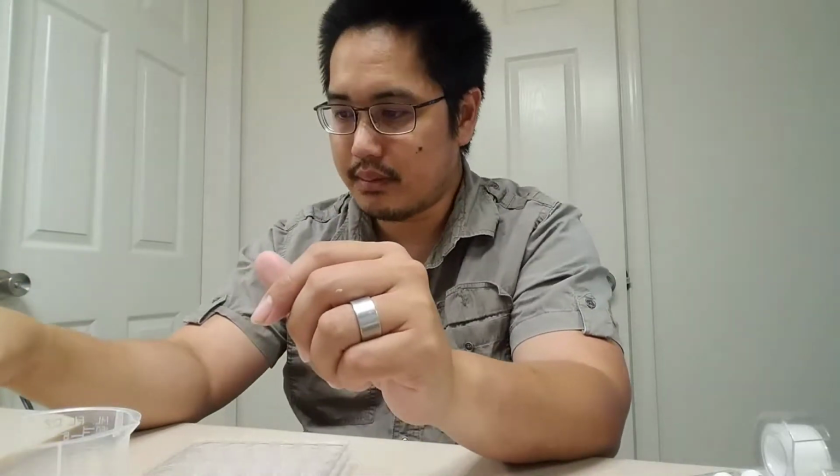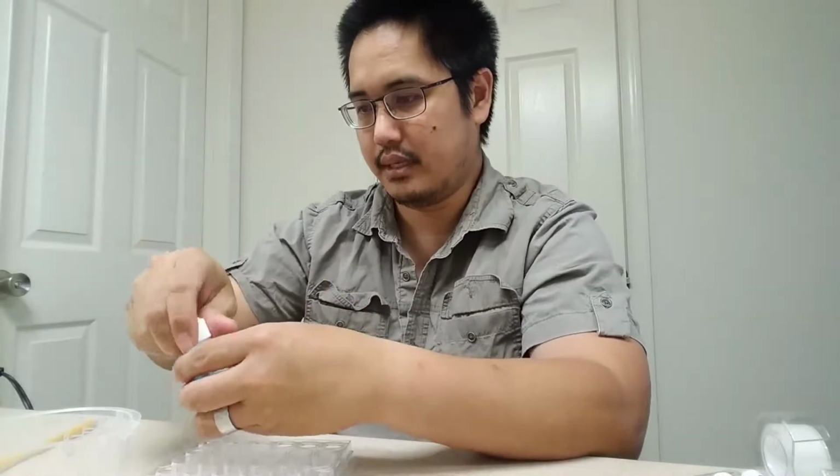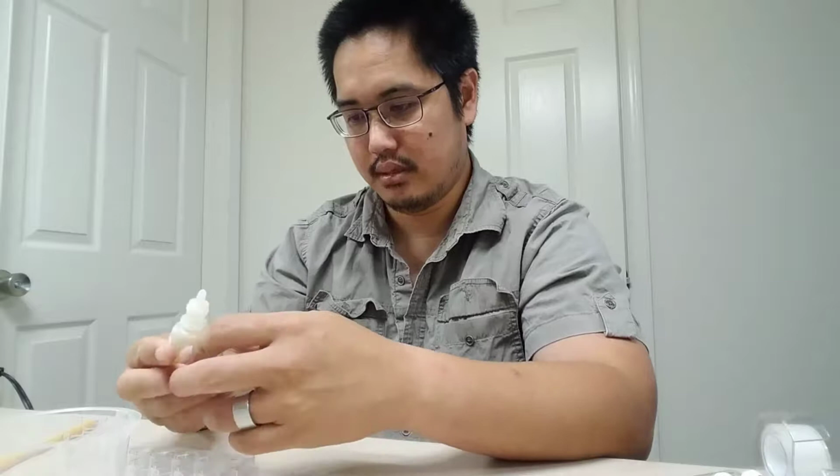The lead in here is insoluble in water, so it's really just going to act as a guide, and it's not really going to affect the experiment as much. Now what they want is 3 drops of copper nitrate, so that would be this guy, and 3 drops of lead nitrate, so that's 1, 2, 3. Let's go with 3 drops of lead nitrate. So that would be 1, 2, 3. Oh, almost got 4 there.